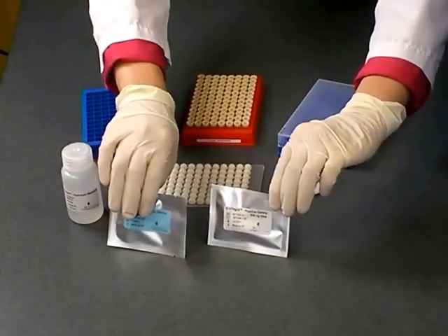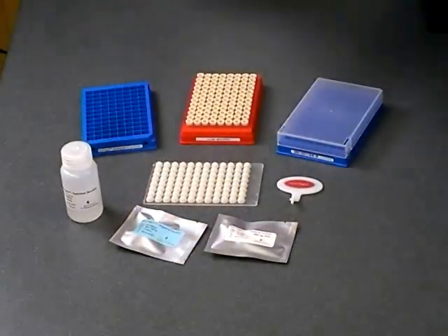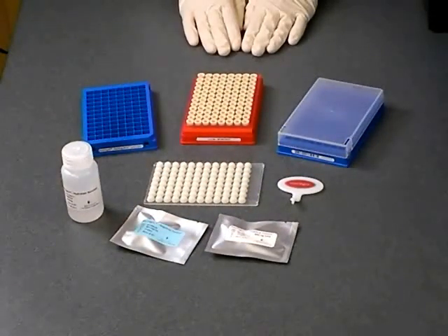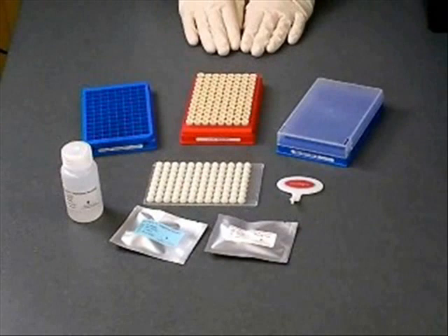The positive control contains human DNA, which can be used as a rehydration or quantitation control. The negative control is a Gentegra tube with matrix but no DNA sample. It can be used as a rehydration, quantitation, or PCR negative control.